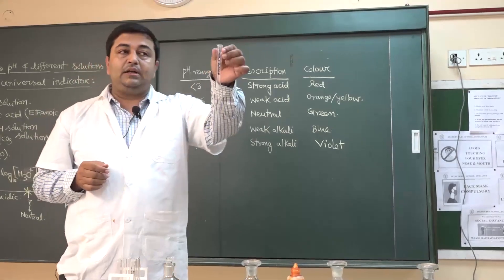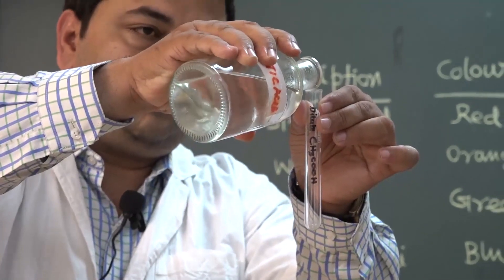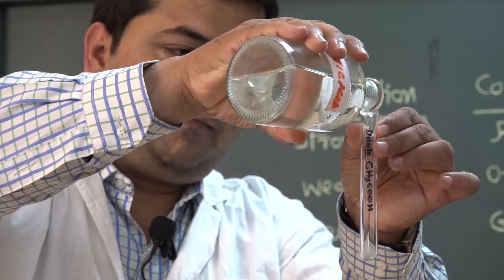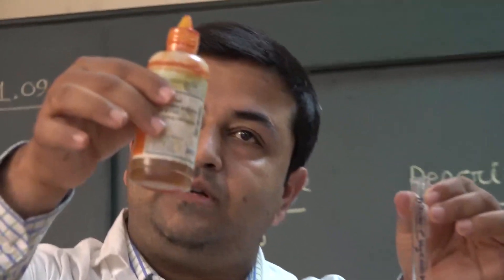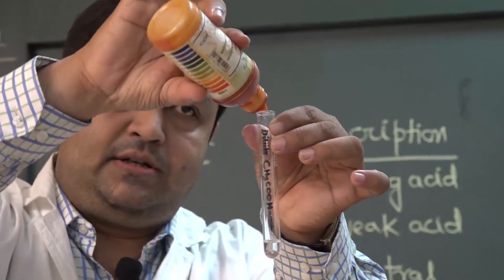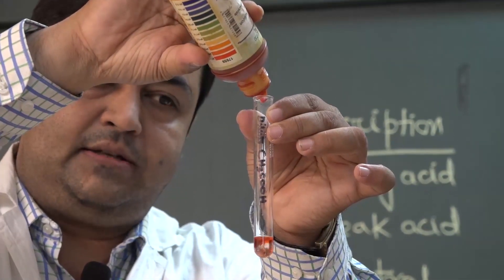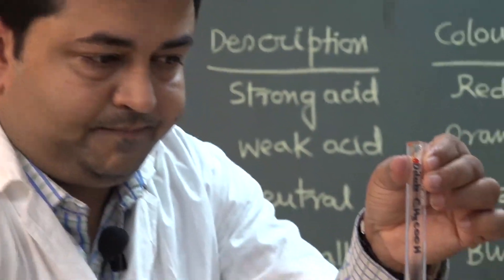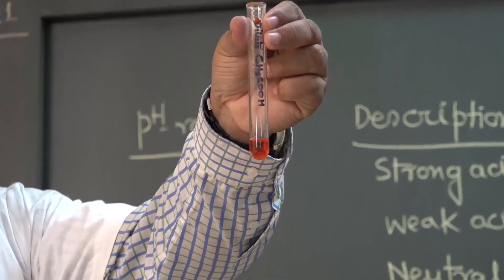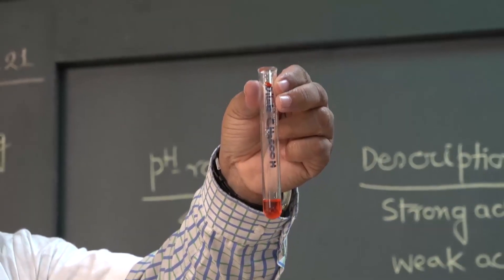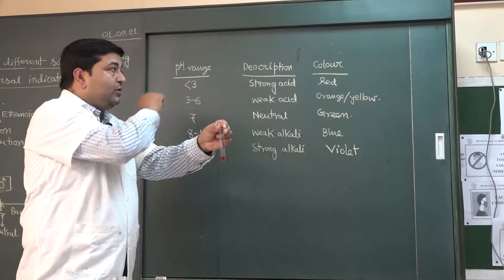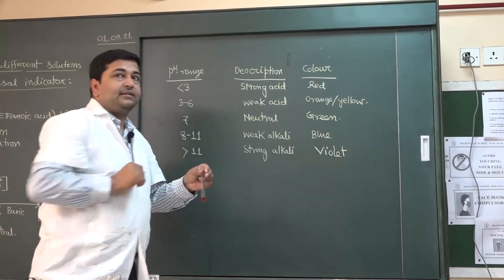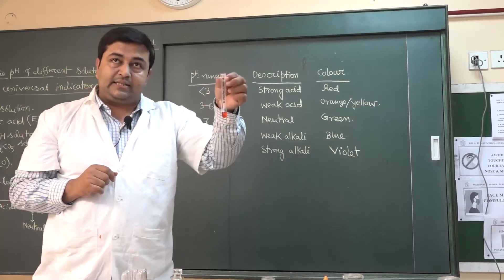Next is acetic acid. In the test tube I am adding one or two drops of universal indicator. The color obtained is orange. According to the table, if the pH value is from 3 to 6 the color will come orange, meaning it is a weak acid. So acetic acid is confirmed as a weak acid.